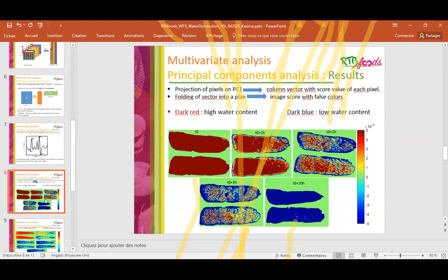Ah, okay. It is from 3 millimeters to 5 millimeters. Yes, this one. The depth is not very large because it works the same way as NIR, the sample NIR, the same way.